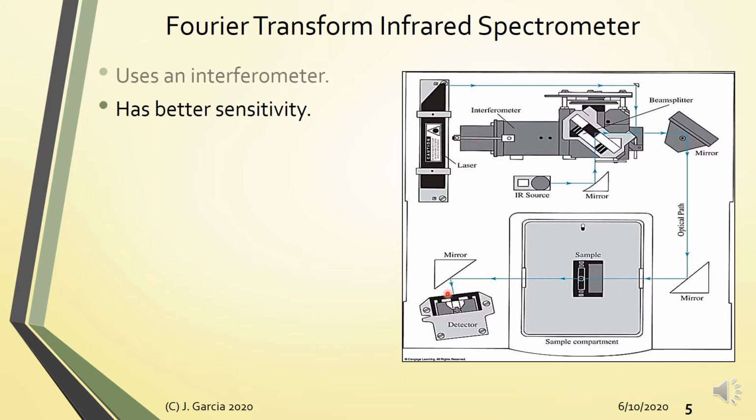So these are ceramic materials, all right. It uses less energy from the source, no? Another way of saying this is that it has lesser attenuation of the energy, power, or intensity of the incident radiation. We said before that the fewer the elements that reduce the energy of the incident radiation, the better the sensitivity.